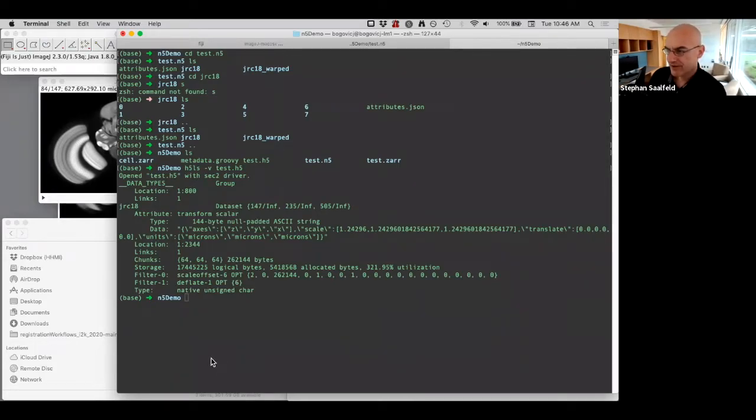So you either define a struct outside in a more stringent type system, or you don't. And that's why we went with this hacky route. You can't count on the container to enforce the schema definition of the metadata. That's always going to be defined by one schema that lives on GitHub somewhere. So that seems fine. You don't want HDF5 to raise type errors. You want the type errors to be handled by an application.